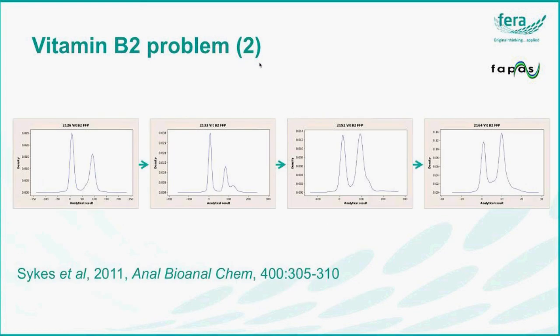We see the outcome of that in the PT data, which is bimodal. So the left-hand mode corresponds to participants that have used only the acid hydrolysis.